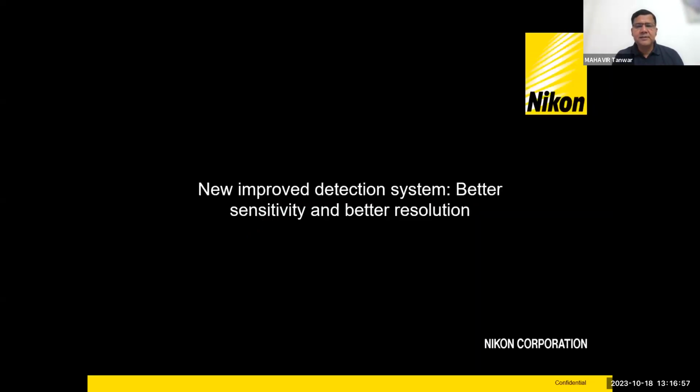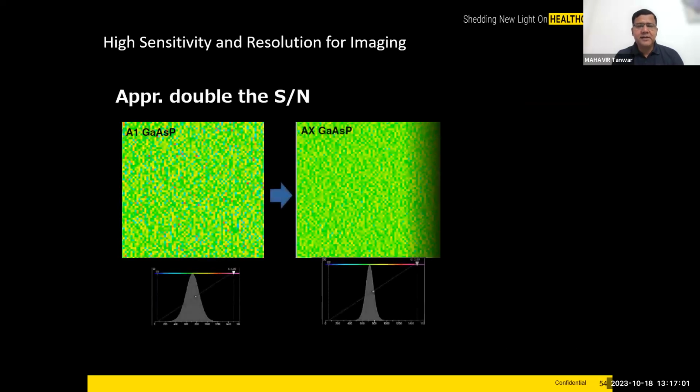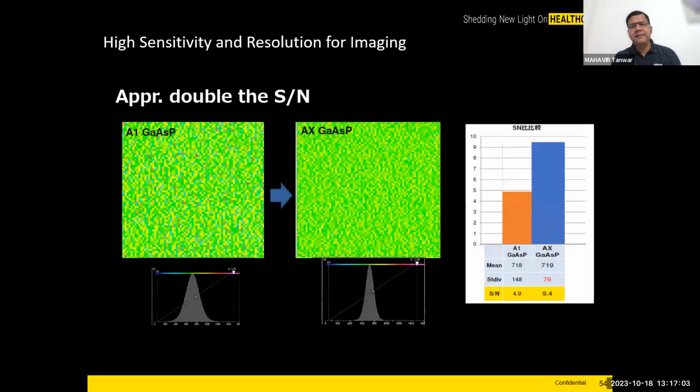It is doing many things. Now, as I was talking in the first few slides about detectors, these days the class of detectors has changed, and these are the types of PMTs. Of course, the quantum efficiency has increased. Quantum efficiency is the amount of signal they can capture, what they can retrieve during the emission of the signals from the sample.